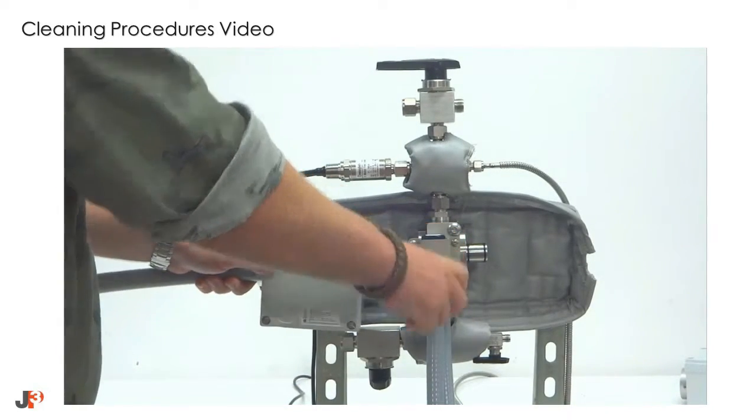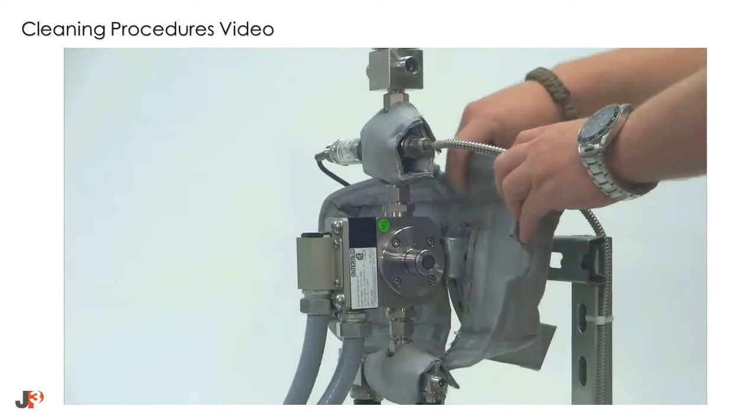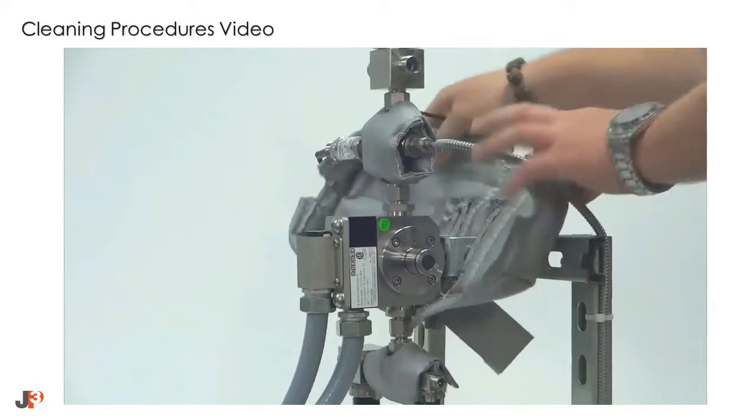Do this for both sides. If necessary, you can remove the rear insulating cover.